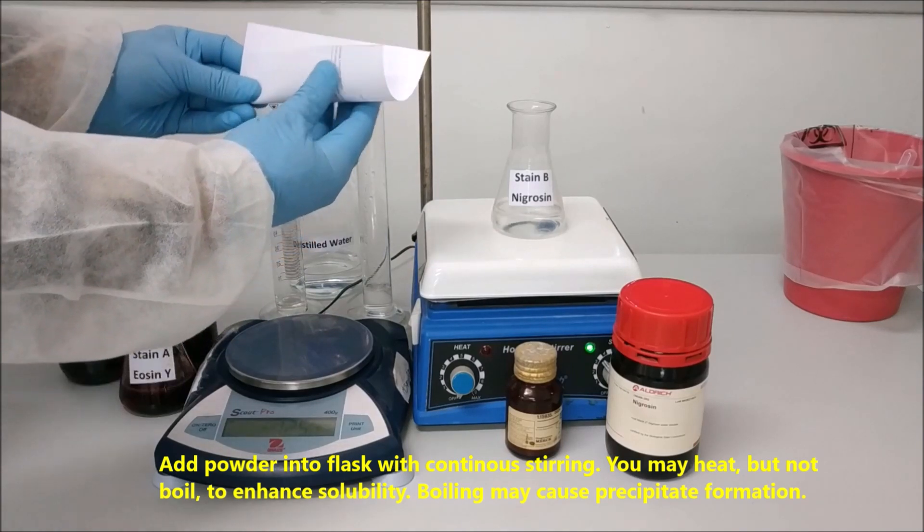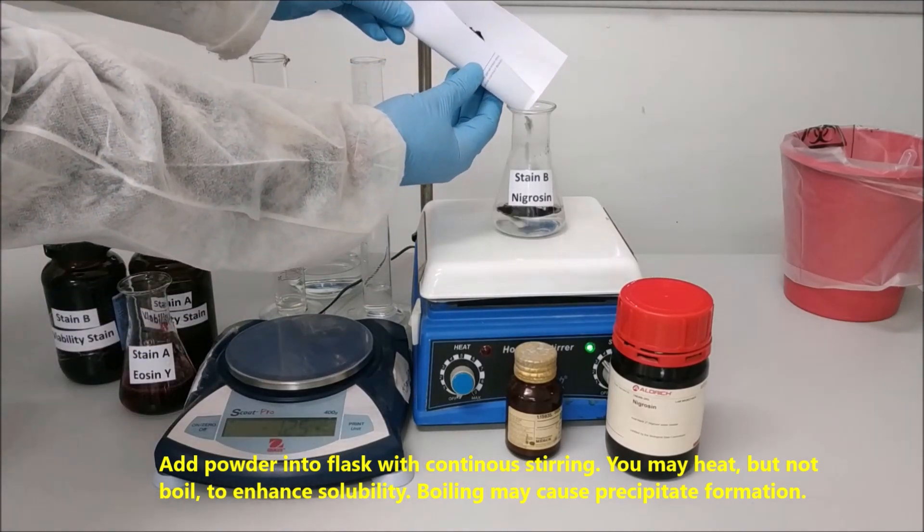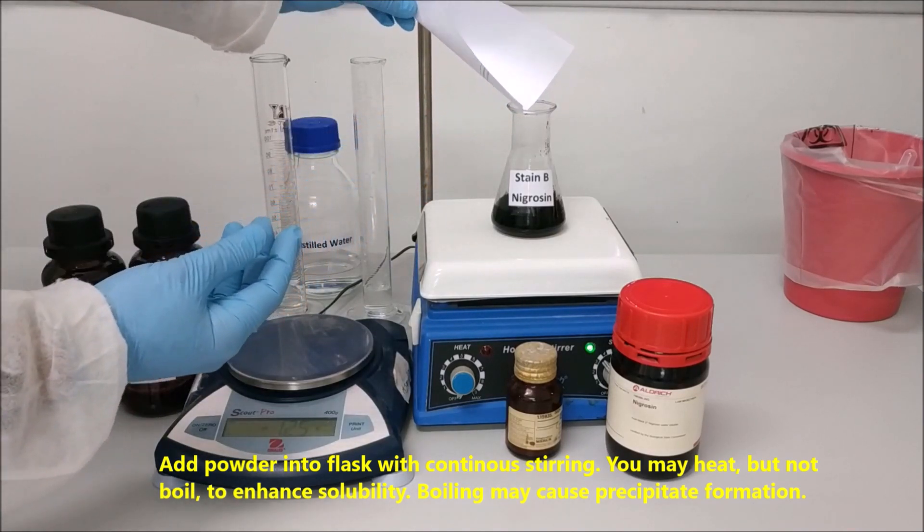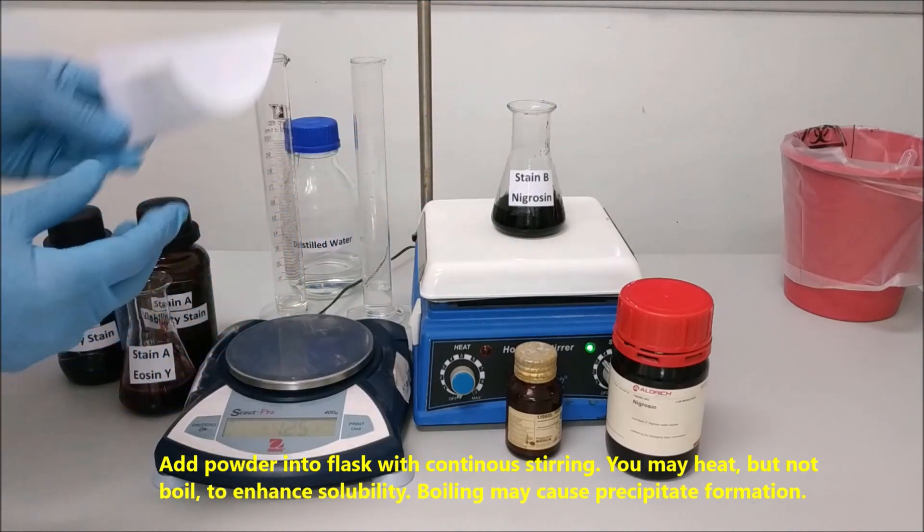Add the powder into the flask with continuous stirring. You may heat, but not boil, to enhance solubility. Boiling may cause precipitate formation.